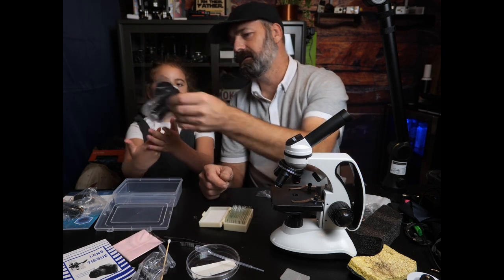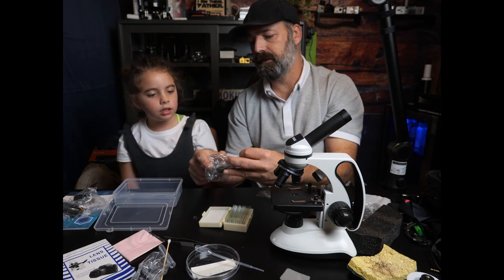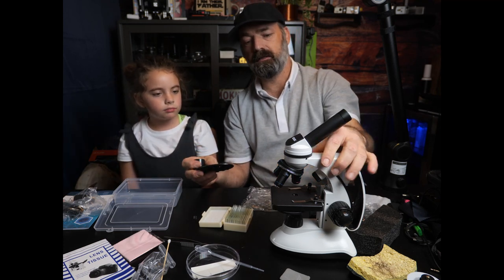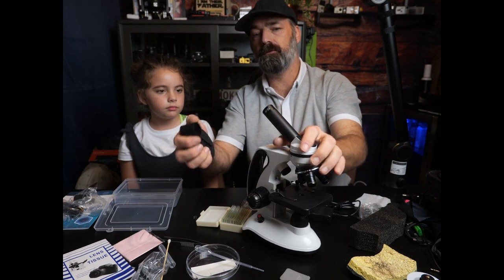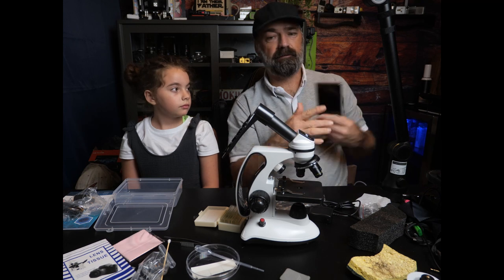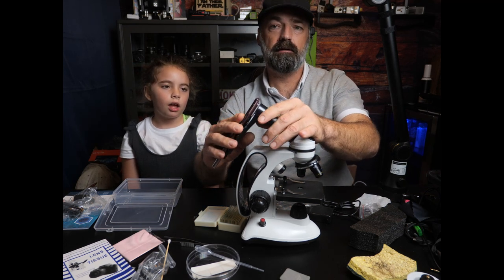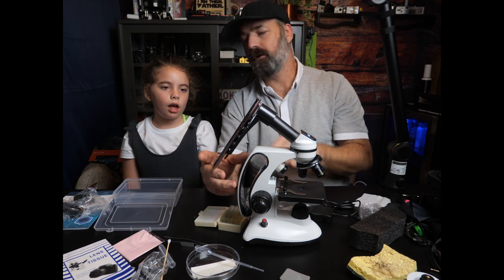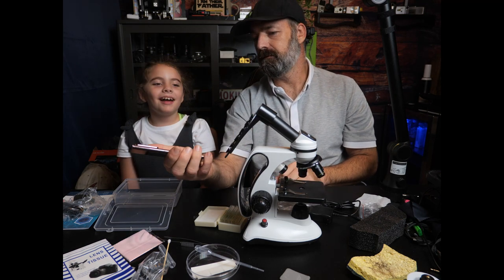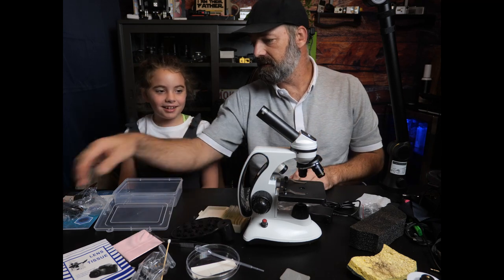You also get a microfiber cloth for cleaning your lenses. And you get this really cool attachment — what it does is it goes over the microscope, and then you take your phone camera and line it up with it and stick it on. You can take photos of the stuff in the microscope. How cool is that? We're going to do that too.